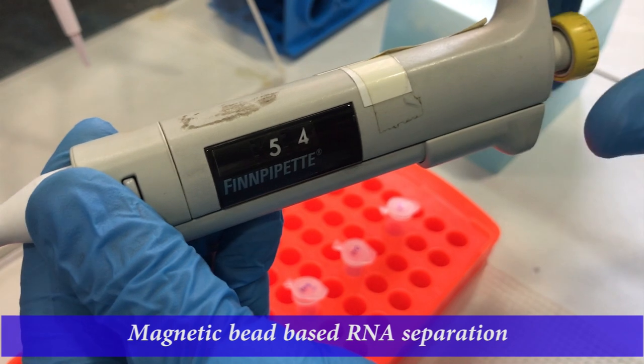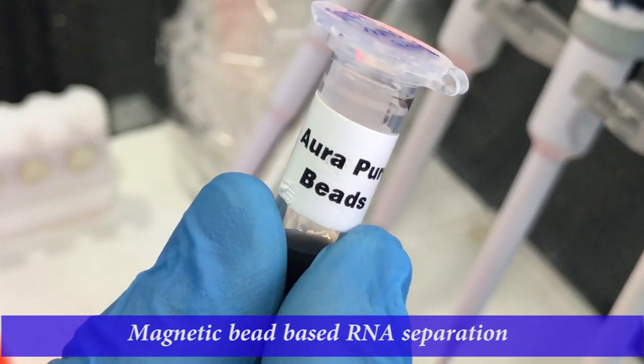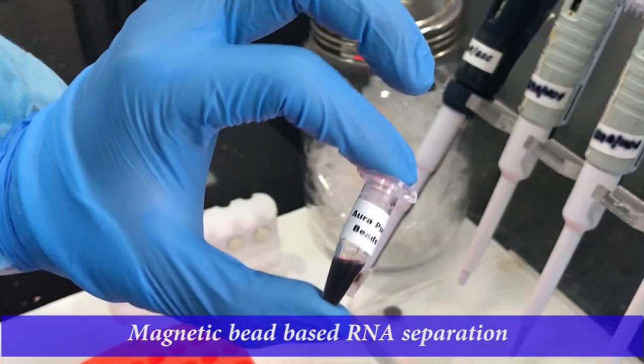Mix the magnetic beads properly and dispense 40 microliters of the beads into each tube, mixing up and down.